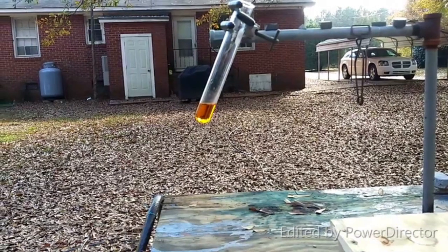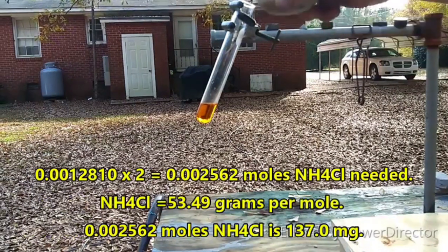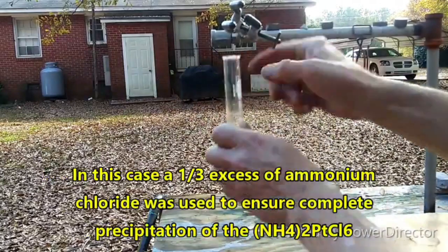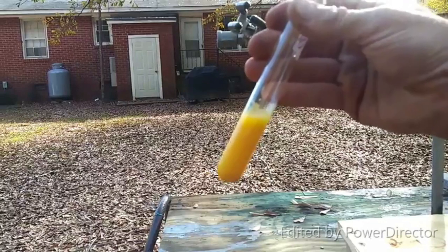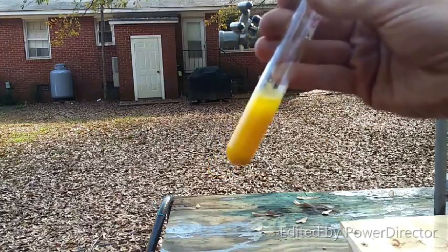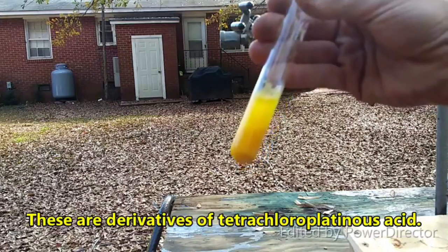So, what I've got here is 5 milliliters of our hexachloroplatinic acid solution, and we are going to add a slight excess of ammonium chloride to this. There we go. And let's give it a little shake, mix it all up. Looks very much like the dicesium hexachloroplatinate. One thing that should be evident as we keep going on, salts of hexachloroplatinate are generally yellow, whereas salts of tetrachloroplatinite are red. And God willing, we should see some of those here after we're done with this one.